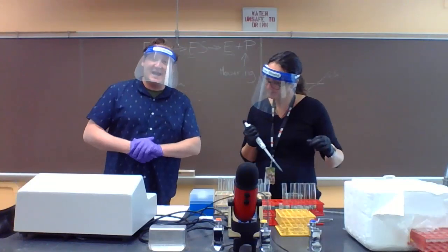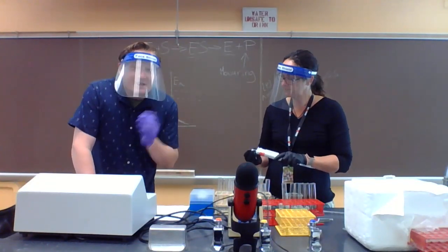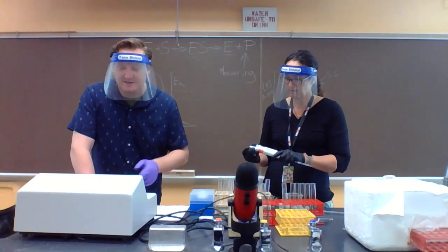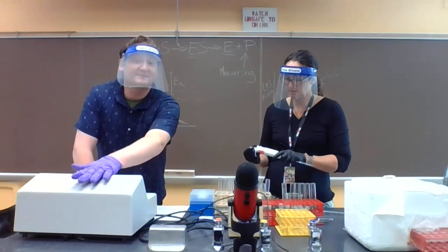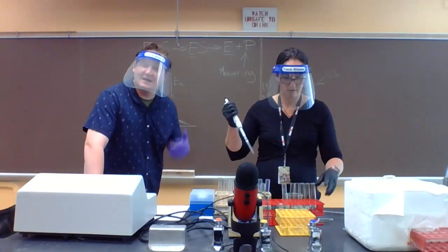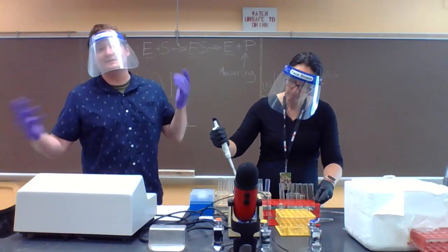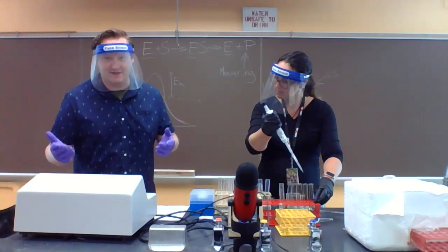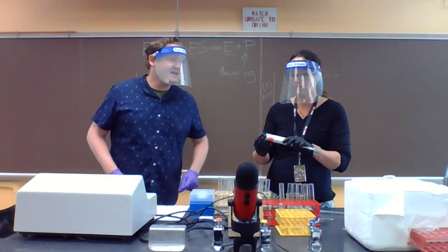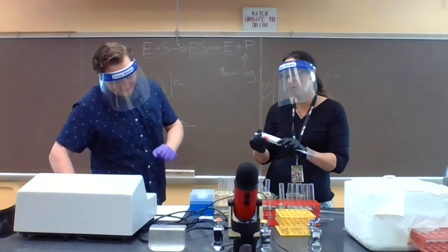So now Bridget is going to be adding varied amounts of the boiled enzyme. Once again, that's there so we're not diluting the natural color of the potato extract, which would interfere with spectrophotometric methods, on account of the fact that the spectrophotometer measures essentially color. In other words, the amount of reflectance and absorbance of different wavelengths of light. If you're not comfortable with that concept, reach out to your TA or reach out to one of us and we'll talk about colors. It'll be fun.